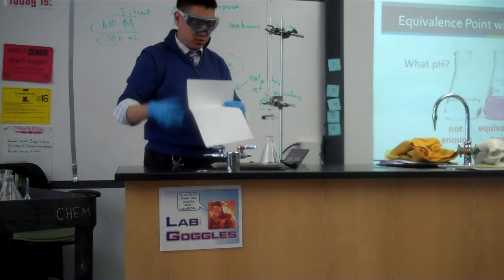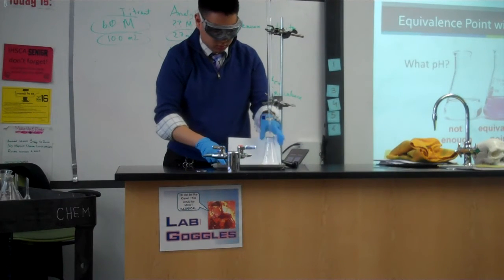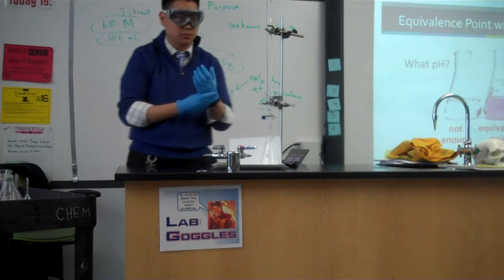And for today's demonstration, I'll put a backdrop of white paper. Do we need that for our lab? No. If you'd like to, you can. It makes it easier to see the color change.